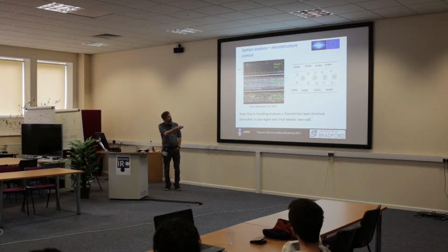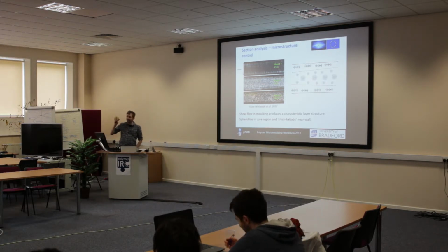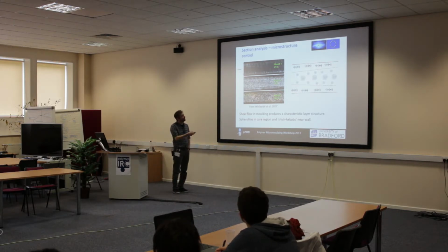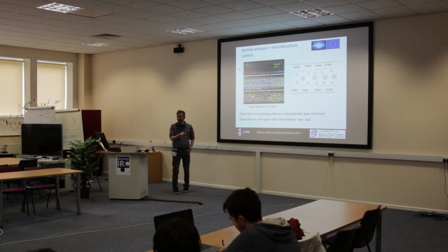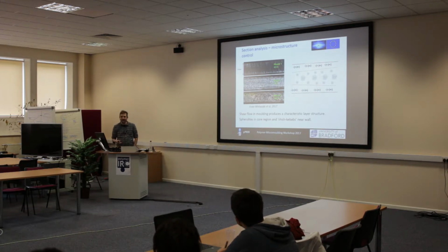So in the center, we have spherulites, large ones right in the center where things have had time to grow, smaller ones next to them, and then out here in the wall region, we have what are known as shish kebab structures, okay? I'm not in charge of the naming. I've got a colleague in Nebraska who's also observed sausages along these dotted lines as well, okay? So get used to it, because no one can come up with a better name, all right?